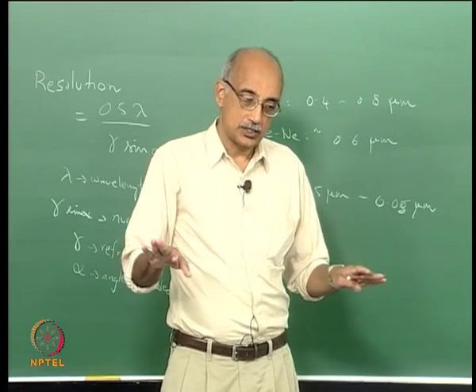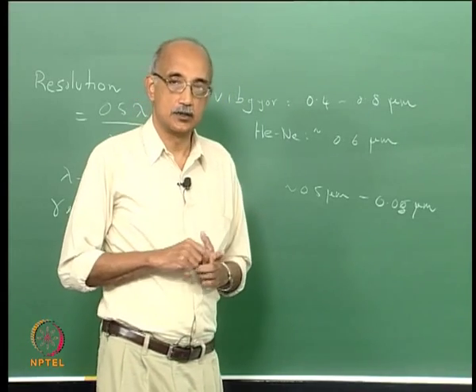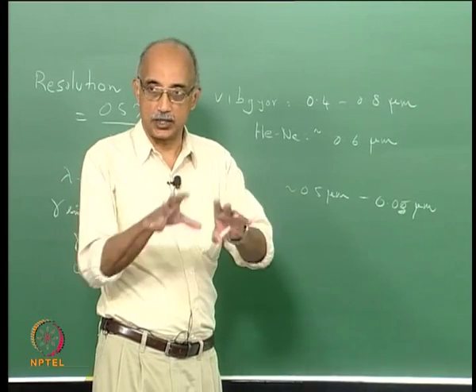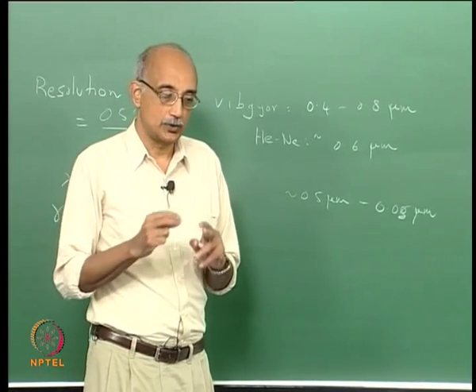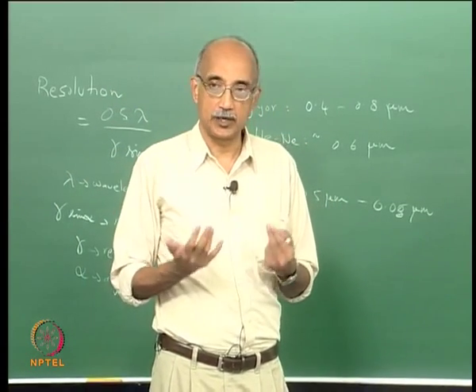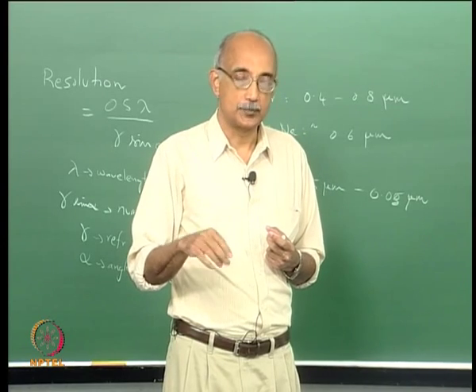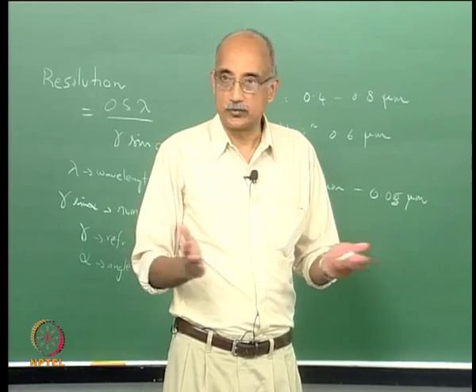There is another way in which you can distinguish microscopic techniques. When you have a large flat surface and you are trying to do microscopic analysis of the surface, you can either initially capture an image of the entire surface and then use software to do your scanning. So, for example, you would capture this image of this tabletop in a camera or some kind of a CCD, and then use various algorithms to analyze the image and obtain the information that you are seeking. This is basically called the imaging mode of analysis.